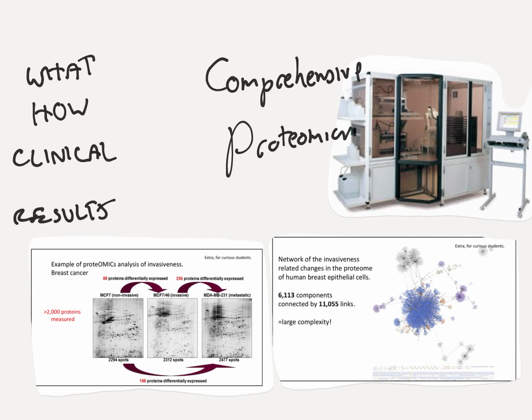So this stuff is very, very simple. The word proteomics in and of itself just means studying proteins. But in our case, this is comprehensive proteomics, as in we're studying proteins by looking at them all at once. So in the previous two videos, we were aiming for specific antigens or protein probes, but in this one, we're studying thousands of proteins together. We're able to look at many proteins at the same time. And this concept is described in one word: unbiased.